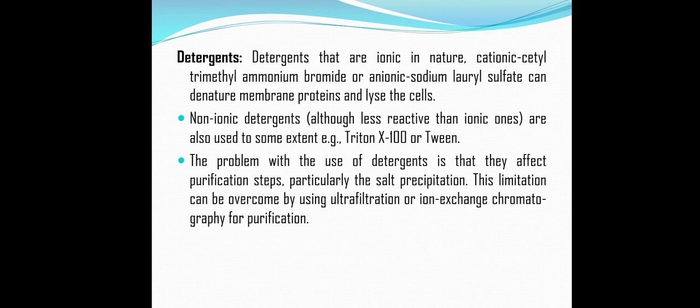Certain other enzymes can also be used, although these are less frequently used for cell disruption. For the lysis of yeast cell walls, glucanase and mannase are used in combination with protease enzyme, depending upon the cell wall composition of the microbial cells. So these are the different methods which can be utilized for the disruption of cells for the purpose of release of the intracellular product.